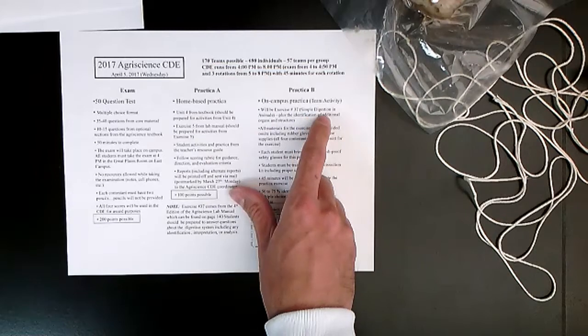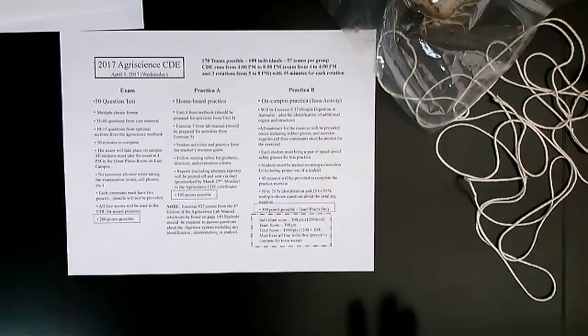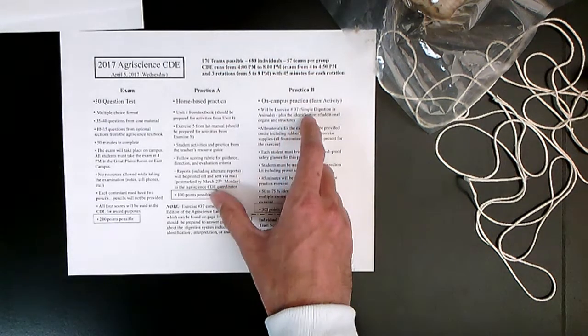It's simple digestion, but I want to point out the students are responsible for identifying and knowing the functions of any of the organs, not just what's in the digestive system. So we're going to go over the organs today, but for an example, they should be able to identify the heart and other organs, not just the organs that are talked about or used in exercise 37.